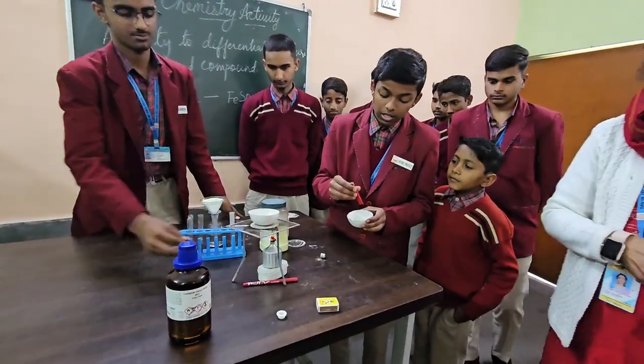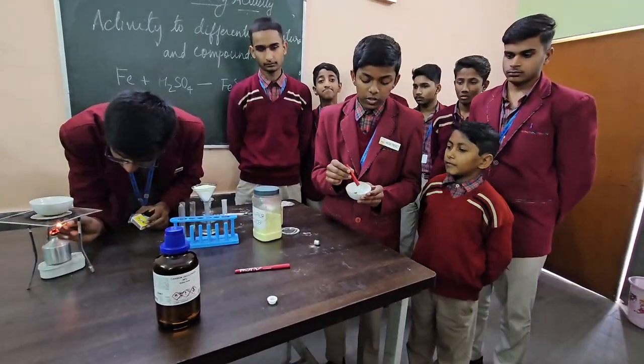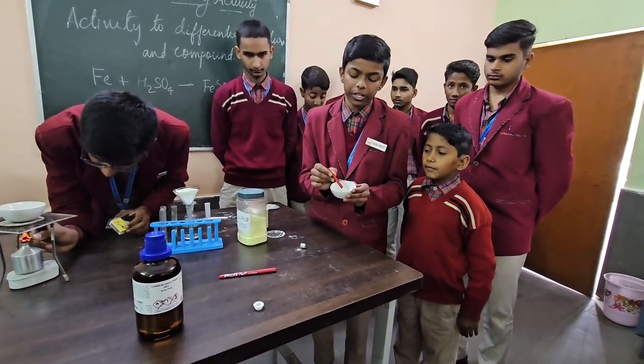When we bring a magnet near the compound, the iron will not get attracted towards it, as the compound has lost the individual properties of its constituent substances.